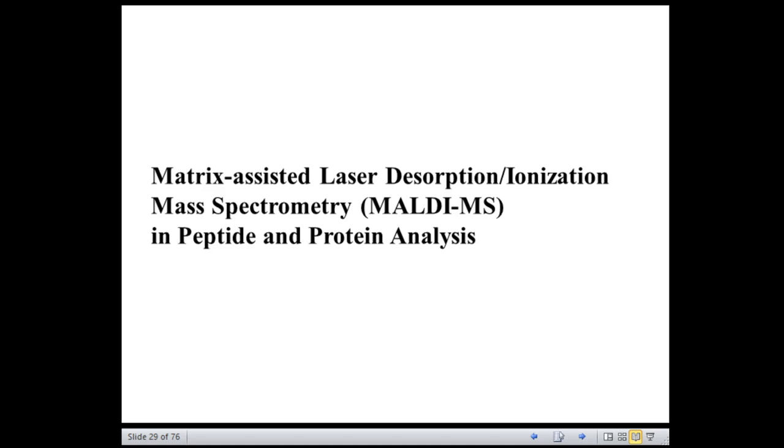The matrix assisted laser desorption ionization mass spectrometry was first introduced in the year 1988, and today it has become a widespread analytical tool for the study of peptides, proteins, and most other biomolecules.